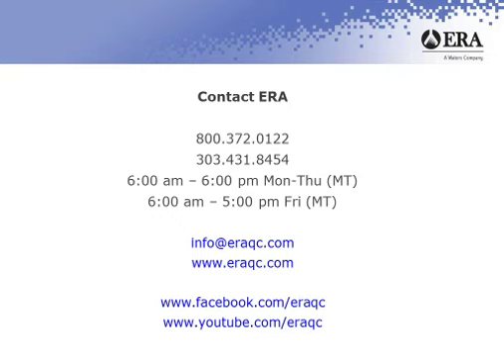Okay, I have another question here. Do you have suggestions on how to have a better count on fecal coliform MPN? Well, hopefully I've covered a lot of that in the presentation, and I may have mentioned this. Probably the most significant thing that I've seen for people doing fecal MPN, if what we're talking about here is a 15-tube test, is to run that additional series of tubes.